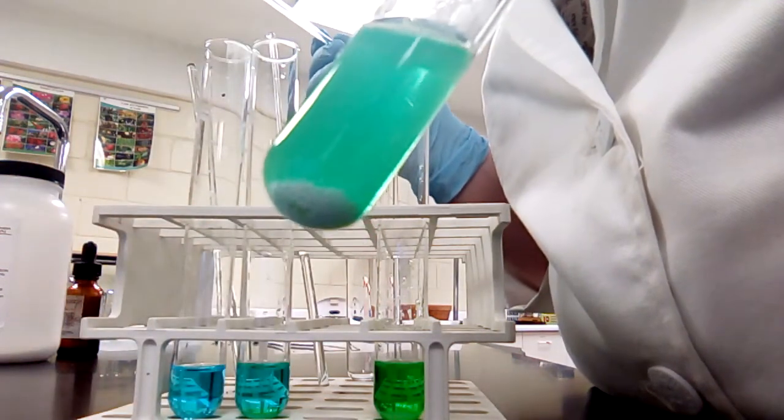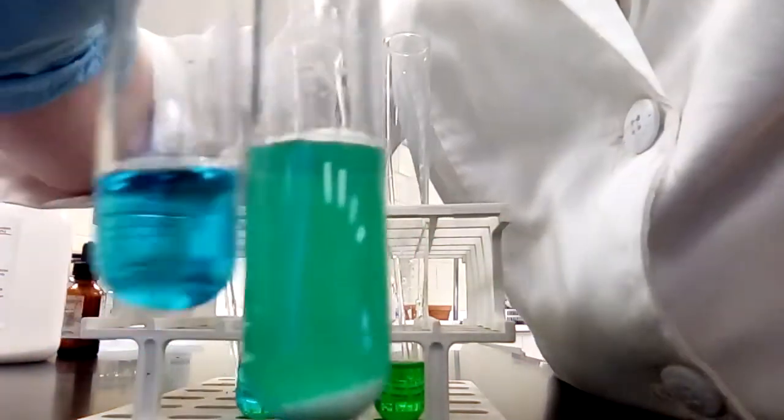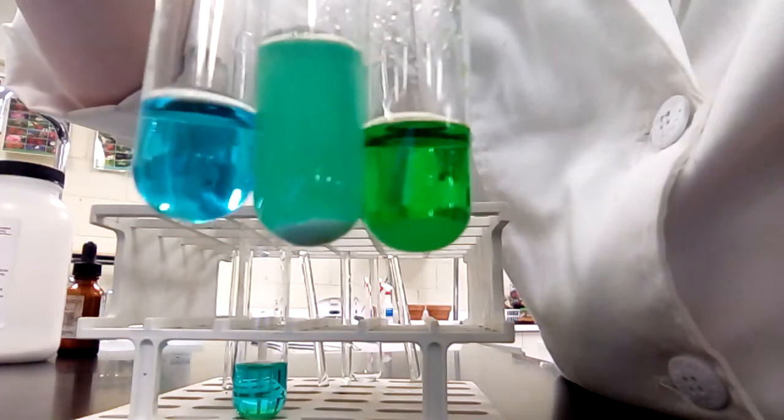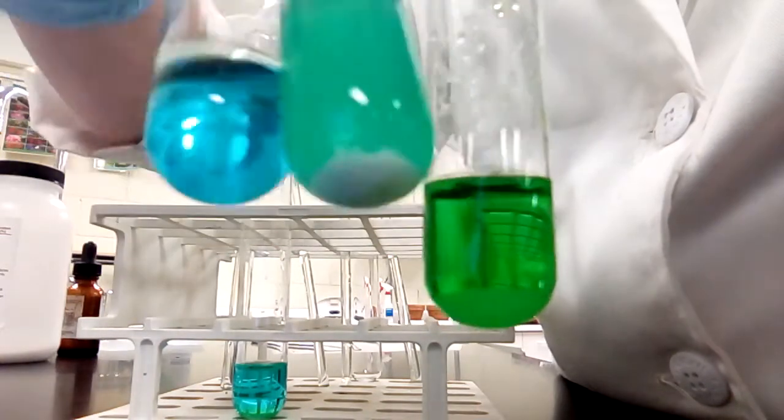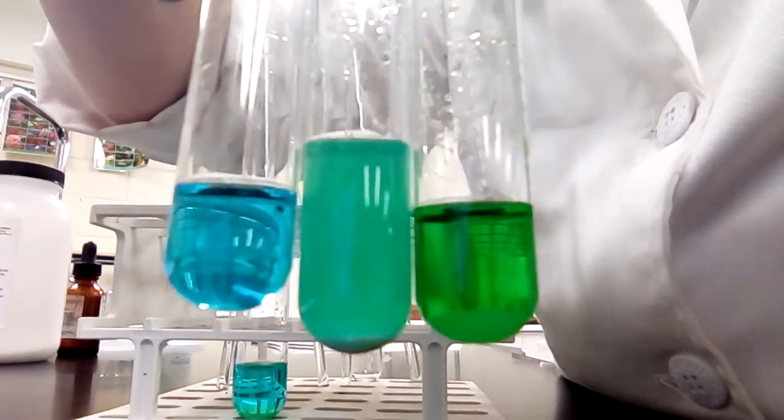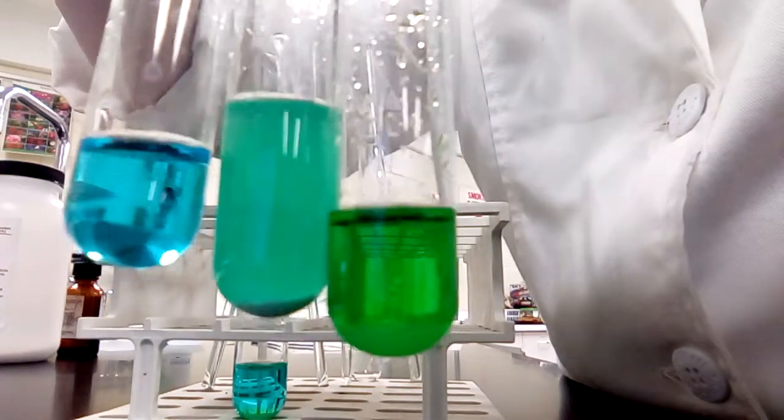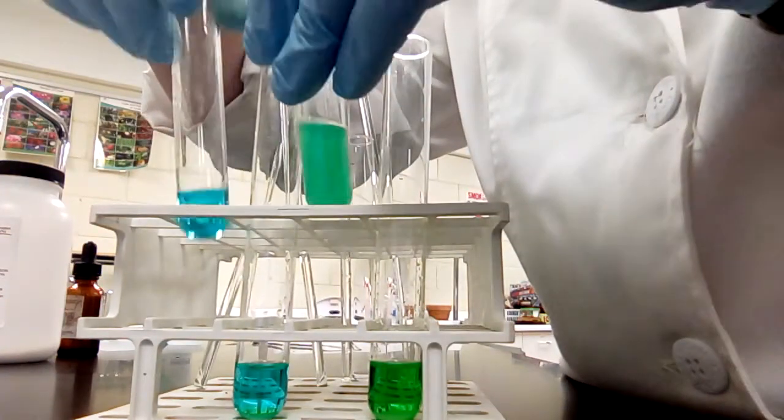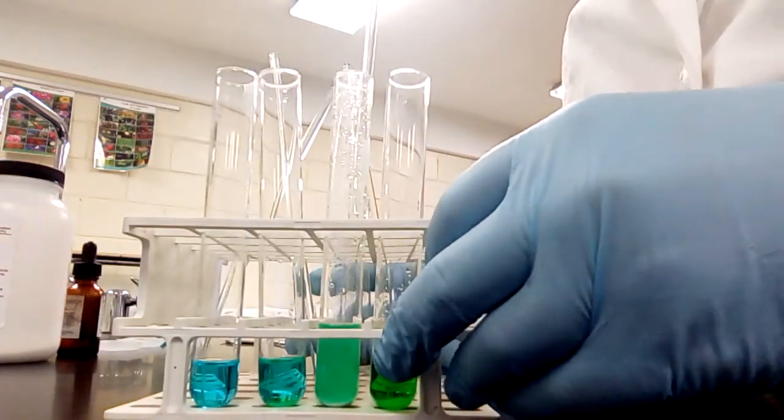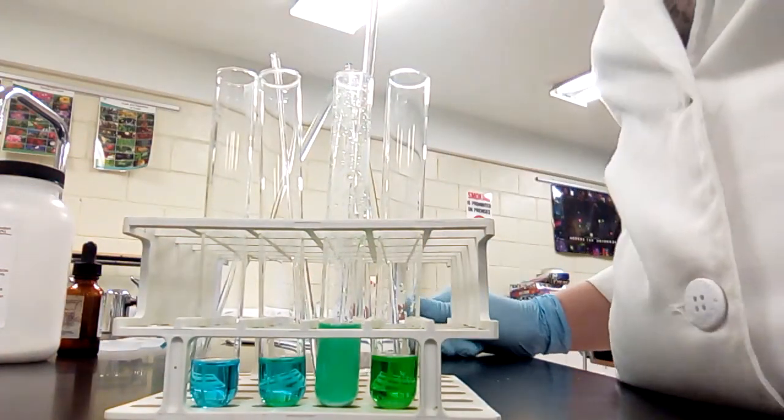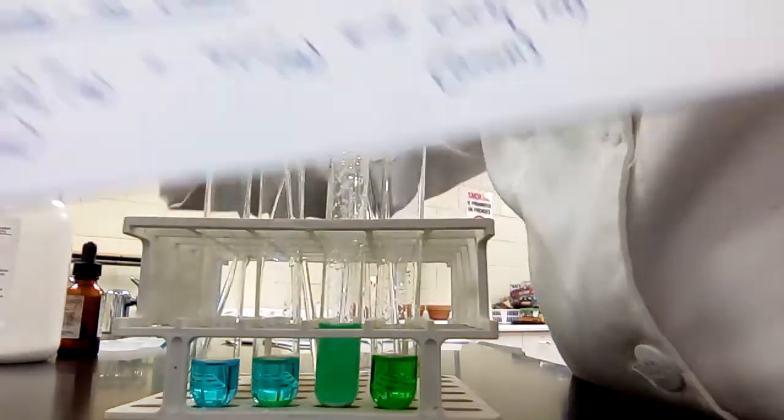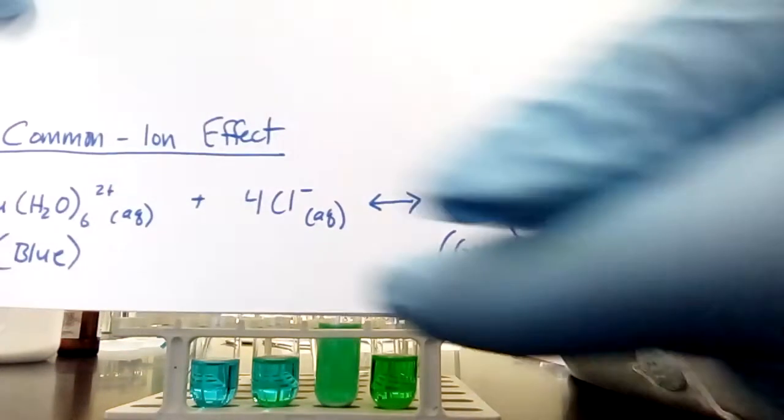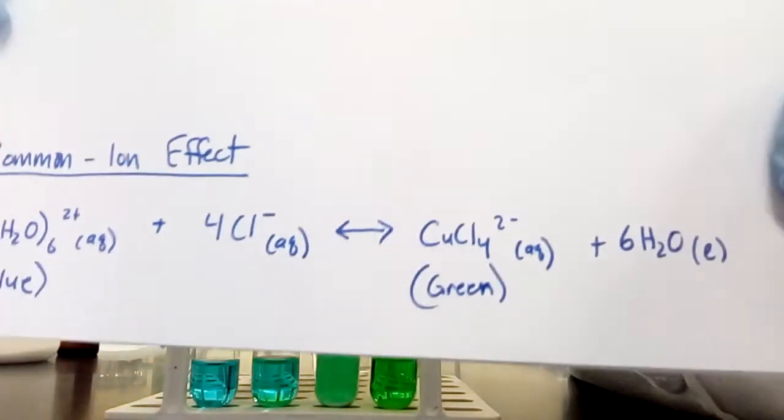All right, so I'm not actually going to tell you, but you can see the reaction and you saw it happen. And for comparison, here's my original color, but then here was the other one. You can see that that's not as green as it was. There's a precipitate in there, definitely something else going on. It's a little bit more blue than it used to be, but it is still green. To my eye, it looks kind of like a light mint green. This is more of a deeper green. And then that blue. Okay, so that was adding silver nitrate. So, see if you can think of and tell me what you think happened there and why that precipitated like that, maybe what happened when you added silver nitrate. So that is the common ion effect. We added something that was not actually in the reaction, but there was a common part, the chlorine, and it changed it pretty drastically. And then we added a third chemical that wasn't in this at all, but that might react with something in here and form some kind of precipitate.